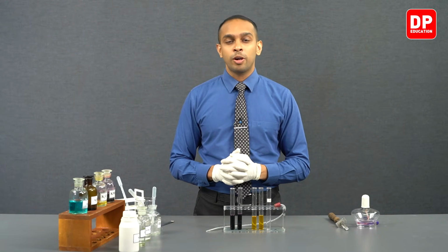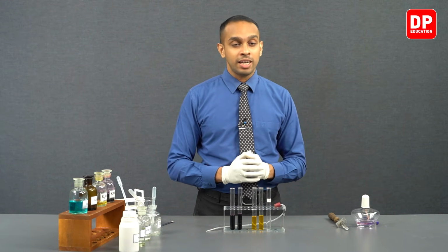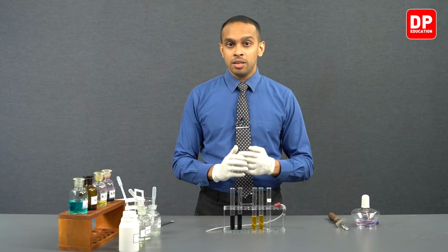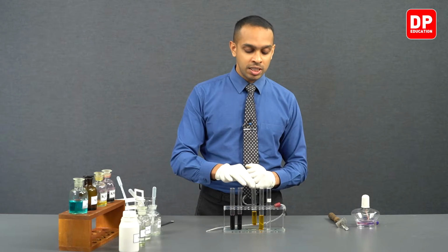Now students, we are going to observe how we can identify the presence of sulfide ions with another reaction. We learned in the previous reaction, when sodium sulfide or any group 1, group 2 sulfides are reacted with hydrochloric acid, it produces hydrogen sulfide, which is a gas that has a rotten egg smell. So this hydrogen sulfide gas, if it is sent through acidified potassium dichromate, we have it here.